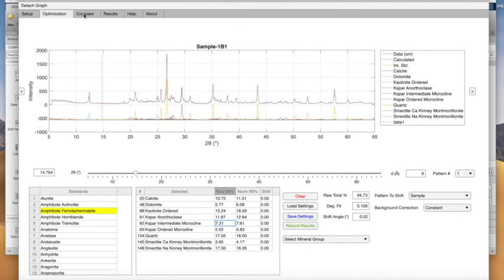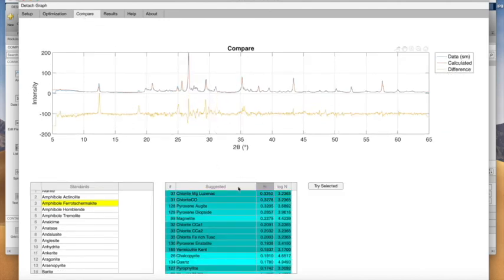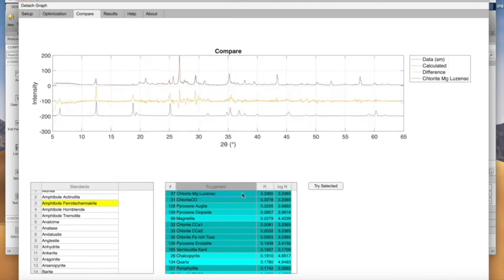So, okay, I'm going to go back to my compare. Now it wants a chlorite. That's magnesium chlorite here. Let me click on that. So notice this little peak right here. This is out of the analysis area, but there's a smaller, sharper peak. I suspect if you calculated the d-spacing, it would be around 14 angstroms. So that would explain this.